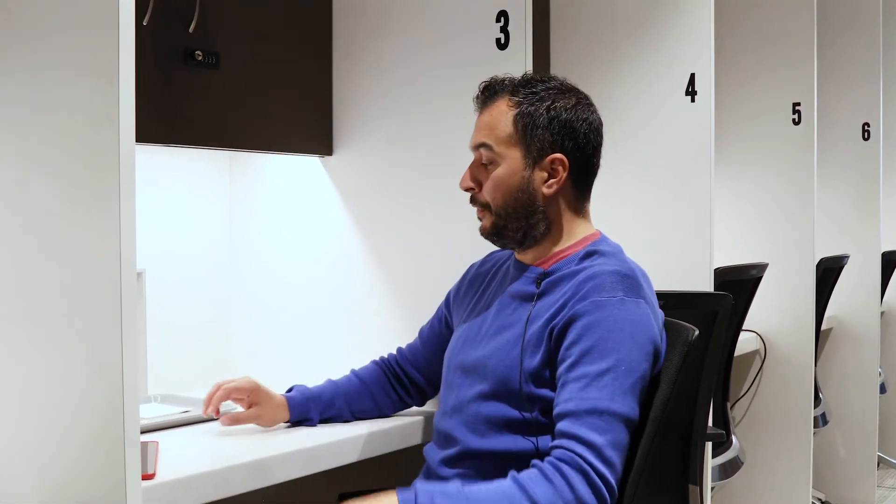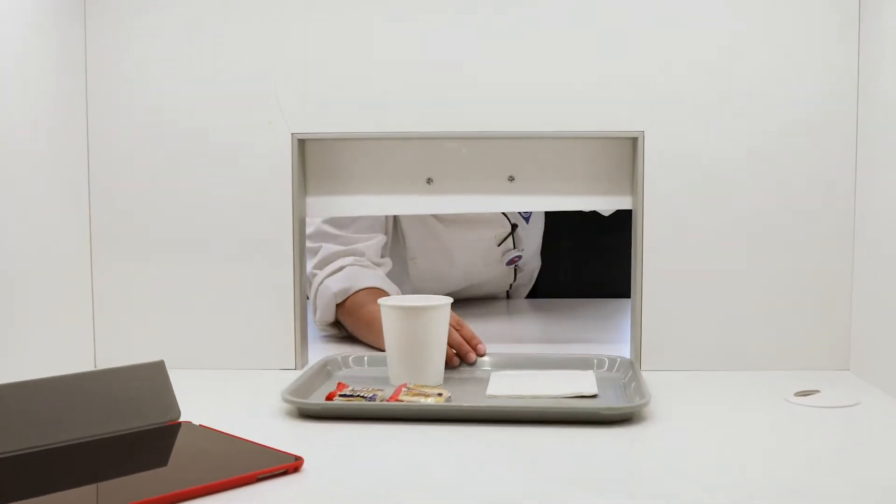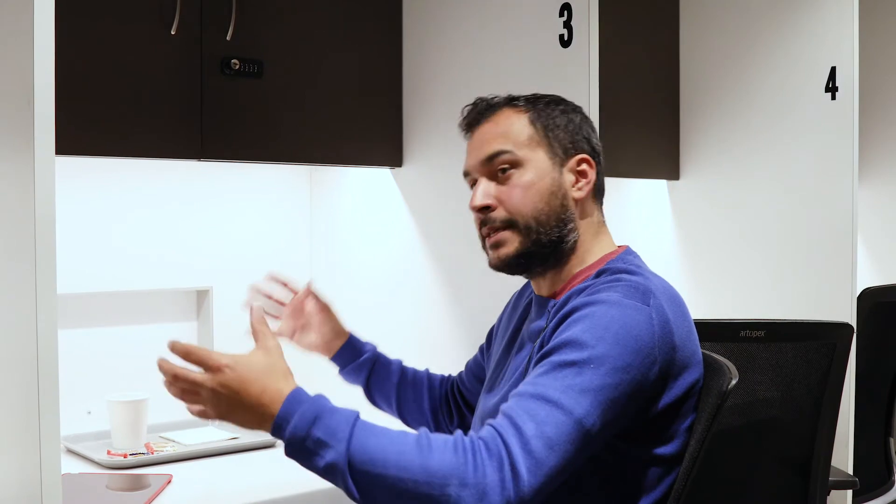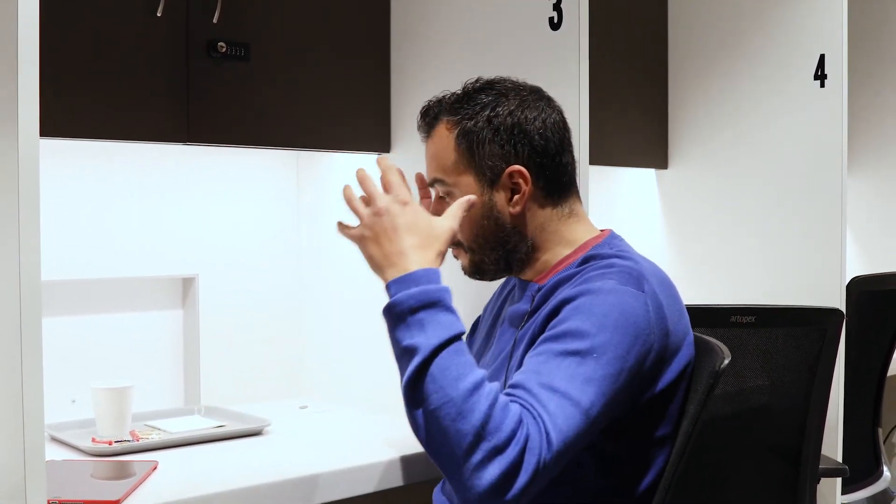This is where the team will put through different types of elements of food. You get to taste these foods and write down all your notes on what you liked, what you didn't like, and you pick your favorite. A lot of companies use sensory evaluation to decide which products they should go to market with, and our students get to be taste testers and helpers to the food scientists in this lab.